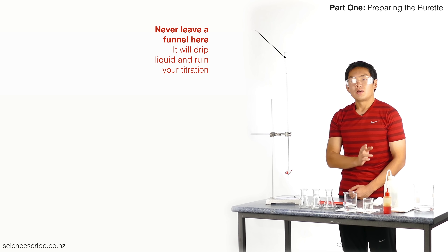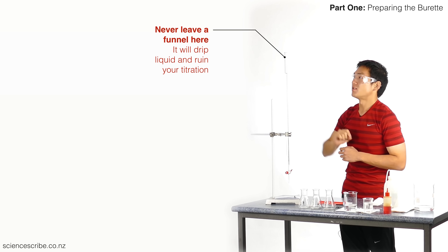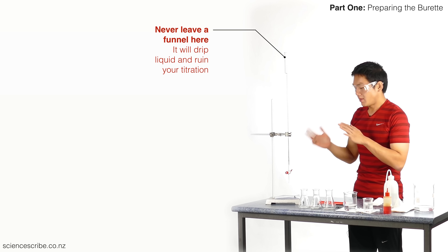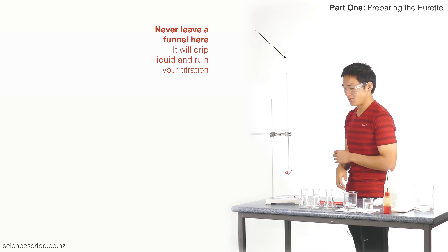I also check at the end that I don't have a funnel left at the top of my burette. And that, ladies and gentlemen, is how you prepare your burette for a titration.